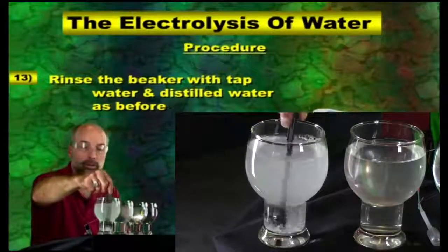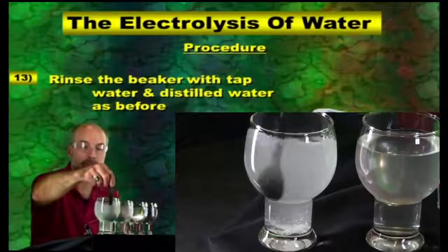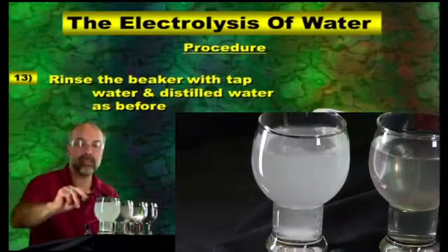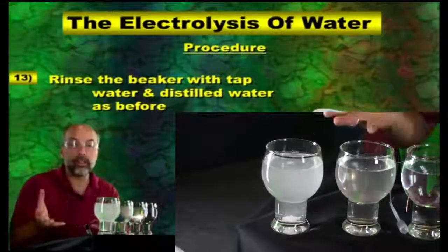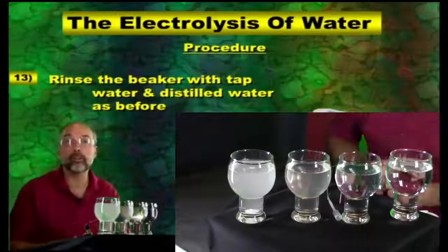Not dissolving real good, but that's okay. We know it dissolves when it's in the washing machine. All right, we'll say that's good. Now, with all that said, what do you guys think? Do you think it's going to have the ability to conduct electricity? If it does, we see bubbles. Or isn't it? Well, there's only one way to try.